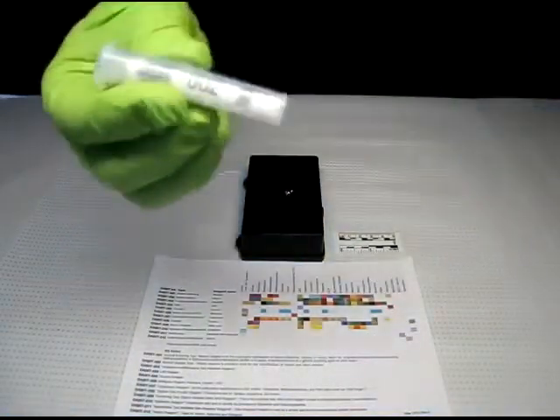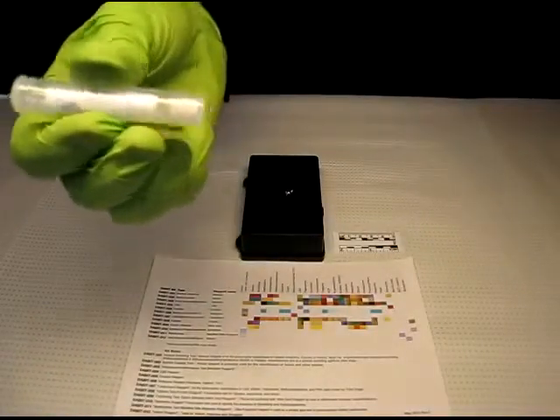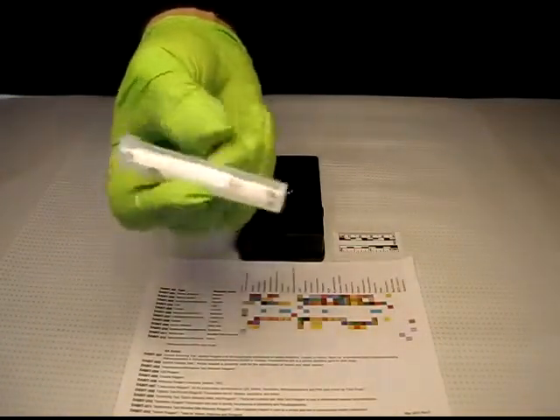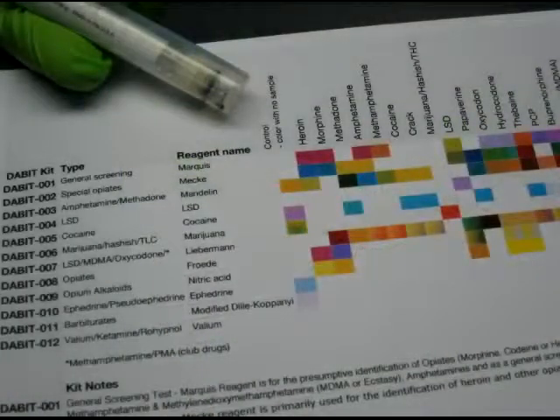Look for a color change on the sampler tip. Consult with the color chart. In this case, the color closely matches heroin. Refer to the instructions to verify these steps and the results.